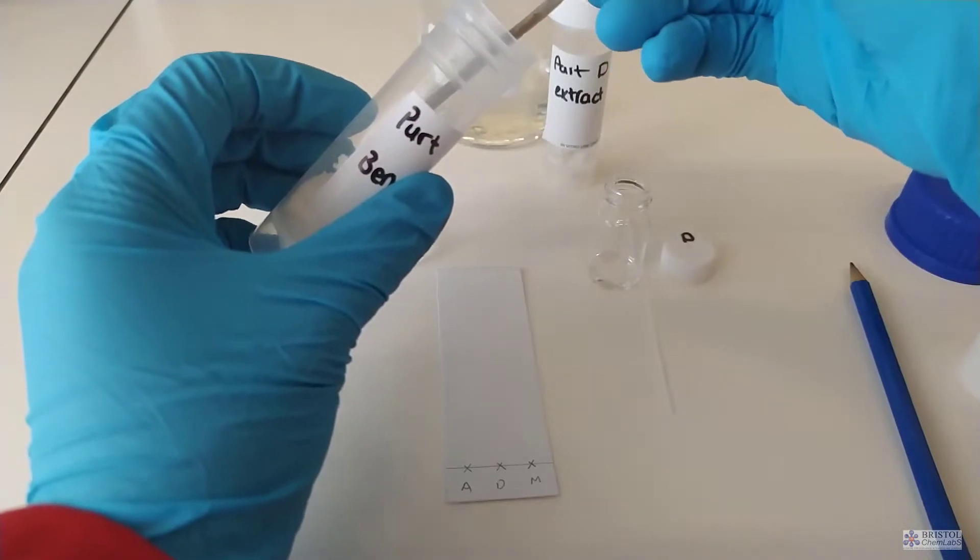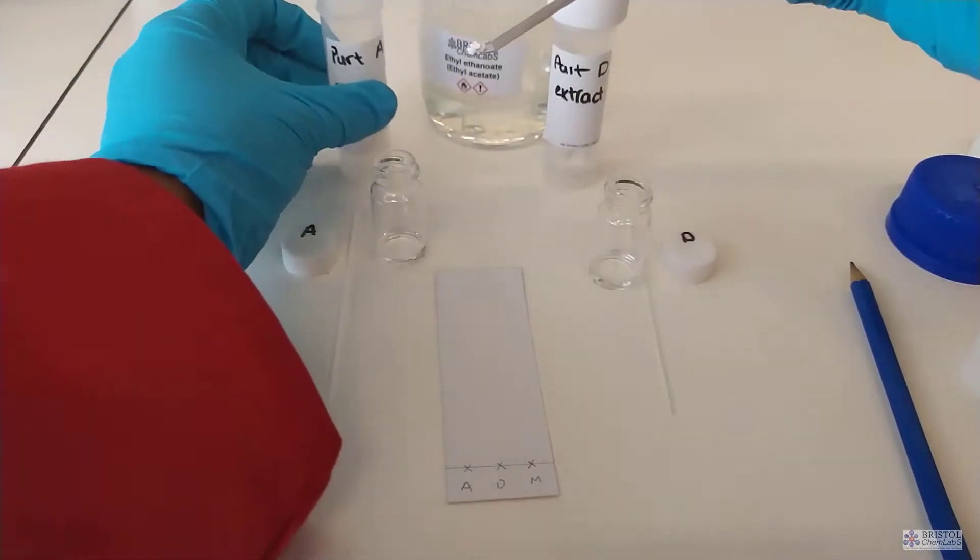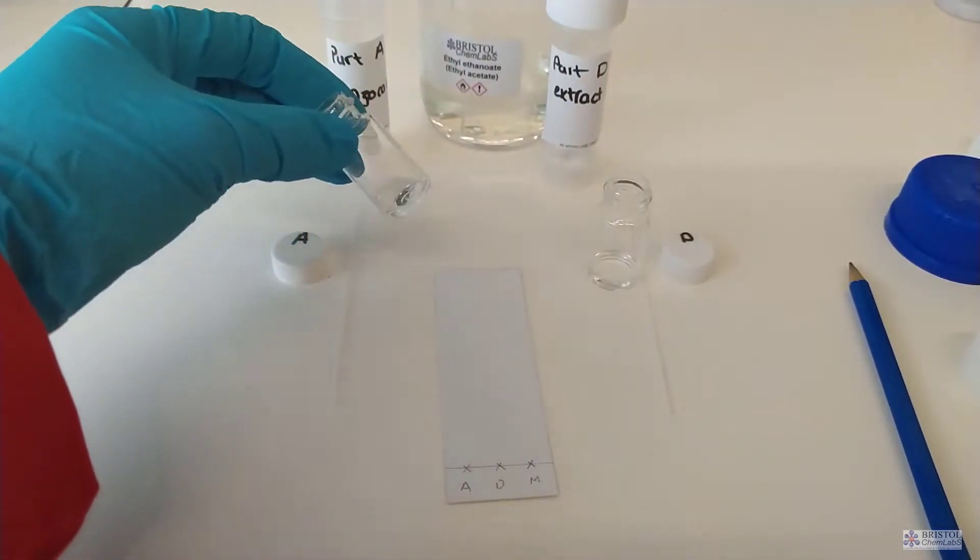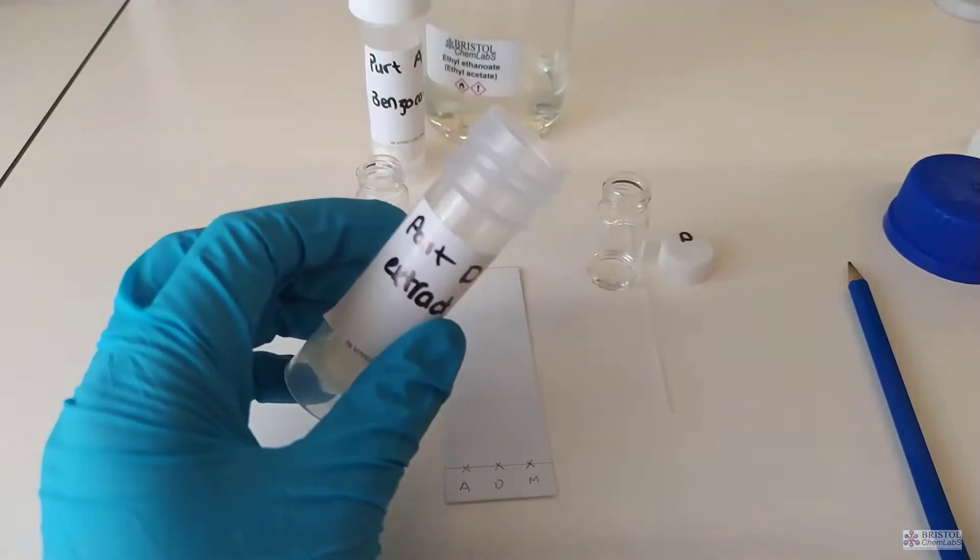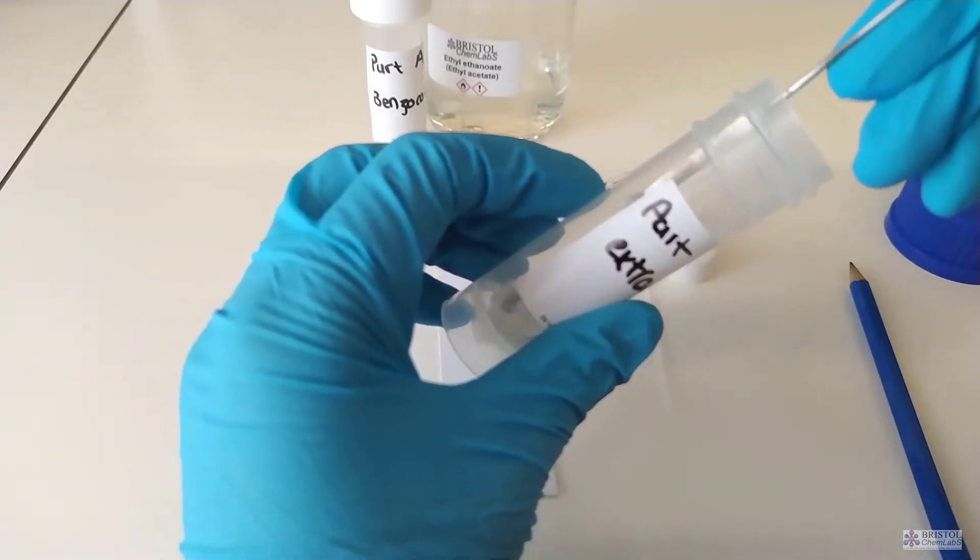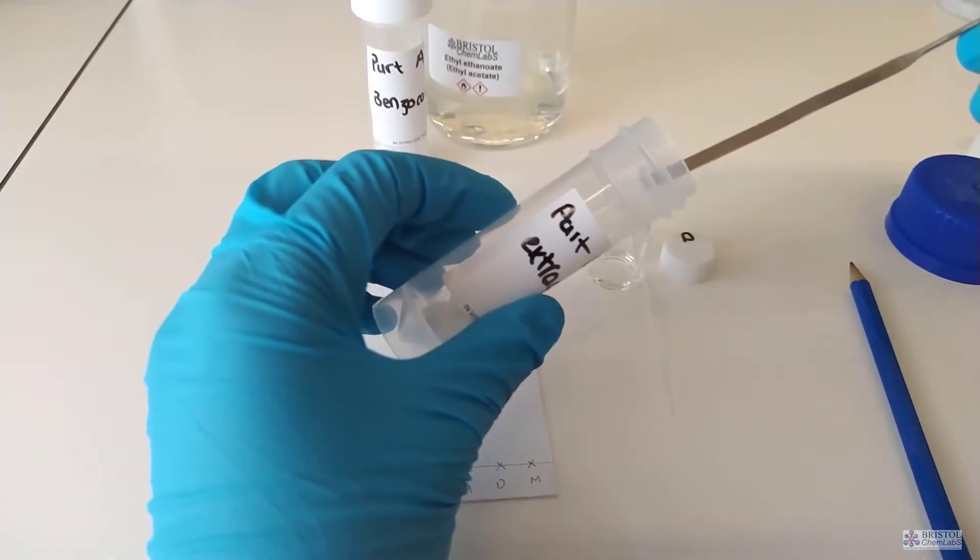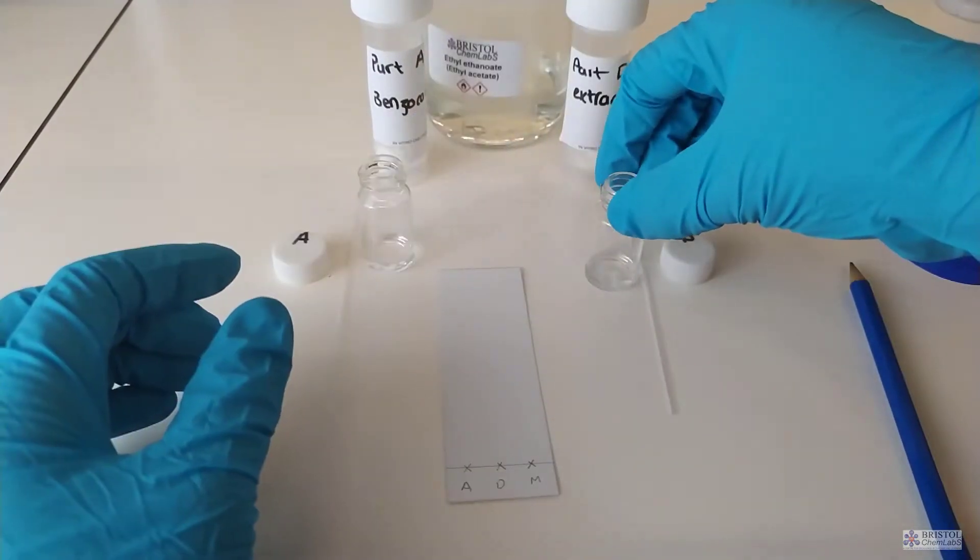Make up some solutions of the samples under test. Here we're going to make a solution of pure benzocaine and the benzocaine produced in the reaction. We dissolve up small amounts of our sample into an appropriate solvent such as ethyl ethanoate.